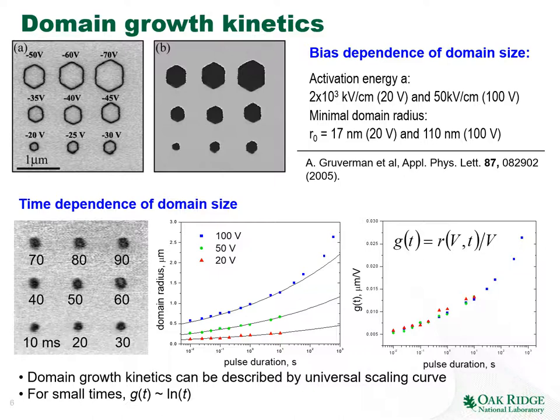And you can see that the higher the voltage is, the larger the domain. Similarly, we can study the size of the domain as a function of time, for example, here ranging from 10 milliseconds to 90 milliseconds. If you do these measurements in sufficient amounts, we can get the growth curves which show the domain radius as a function of the pulse duration. So this is the domain size versus time for 20 volts, 50 volts, 100 volts.